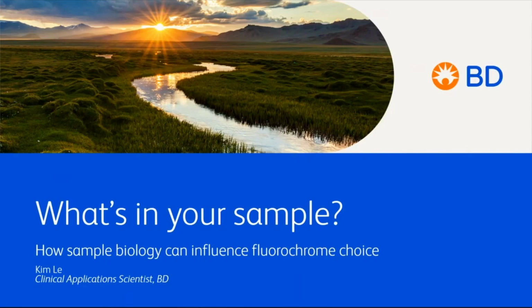I am very excited to kick off the panel design three-part series with this webinar, which focuses on how sample biology can influence fluorochrome choice in designing flow cytometric panels. The second talk will cover the characteristics like fluorescent spillover and spread that occur when you include multiple fluorochromes in a single panel and how to mitigate those effects.